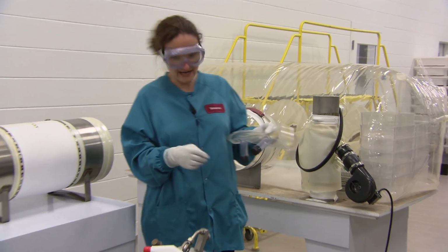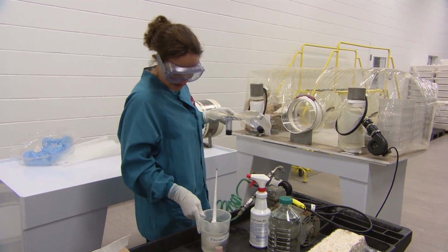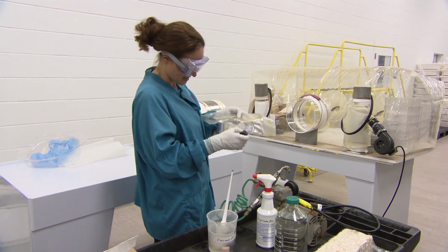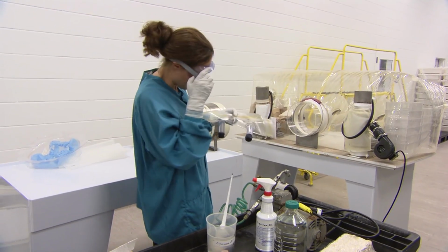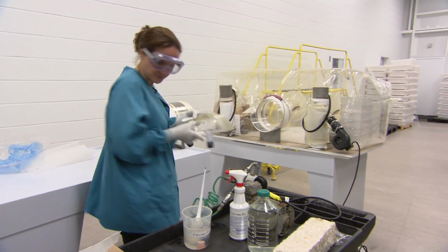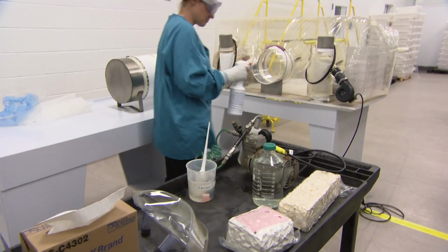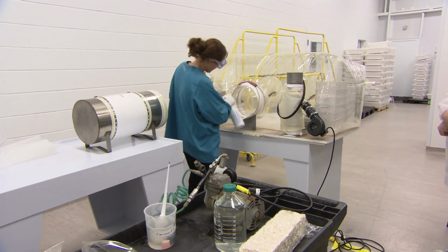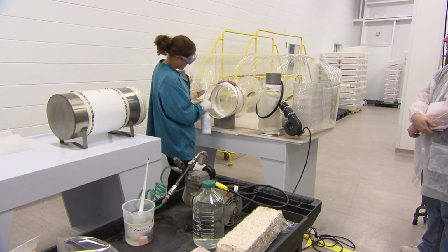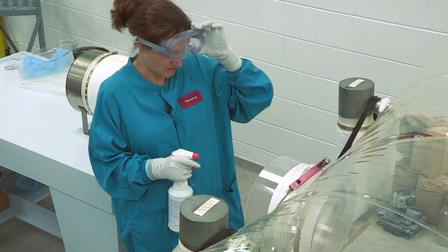Now I already have some plugs that are soaking in our sterilant. You want to make sure that you check your plugs for no holes and no cracks. If you do find holes or cracks, you want to throw them out and get new ones. So the first thing we do is spray our inside port. You want to make sure that you're directing that spray around the periphery. We don't like to leave our ports open for any longer than 15 minutes.